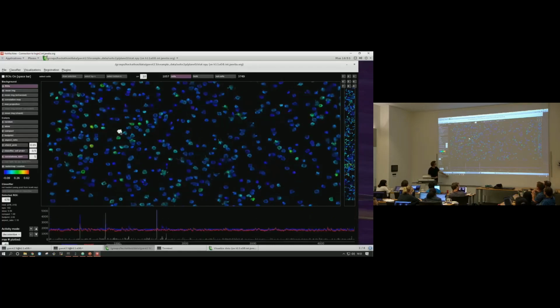Yeah, so there will always be an amplitude of proportionality here, right? So this is what we use. We don't use zeros and ones for 2 reasons. One is what you just said, right? In one bin, we know that some of these huge transients are usually because of multiple bursts, multiple spikes in it. Now, we can't tell you exactly how many spikes there are. We lack a few things to be able to do that. We don't even really have a calibration bar to tell us, one spike should correspond to this much calcium.